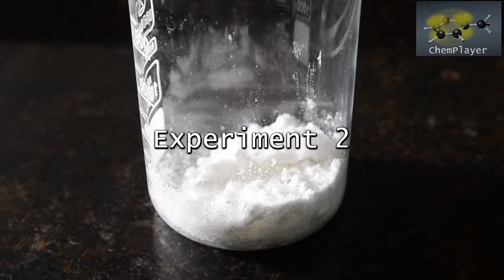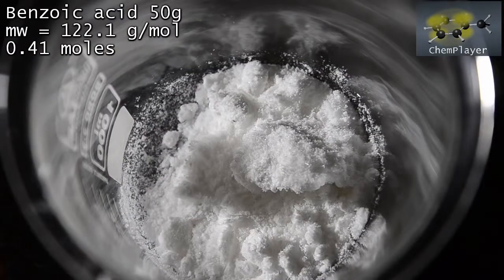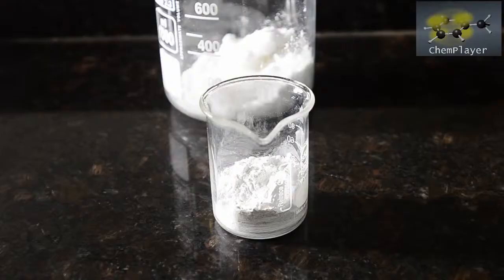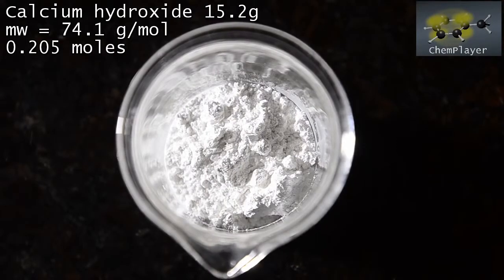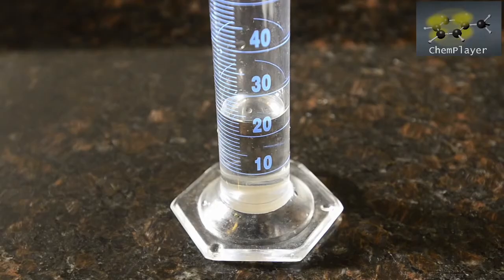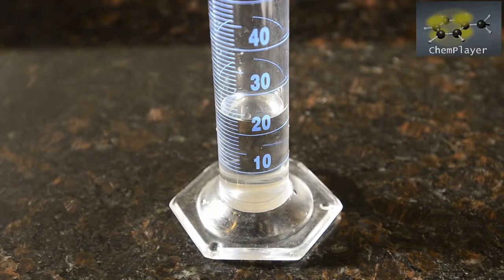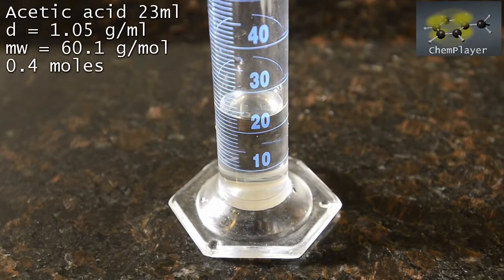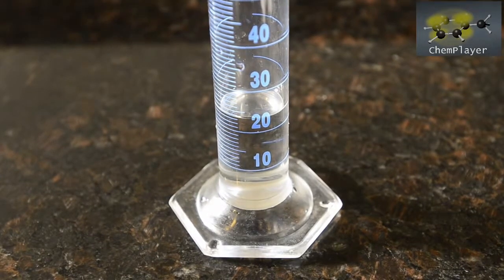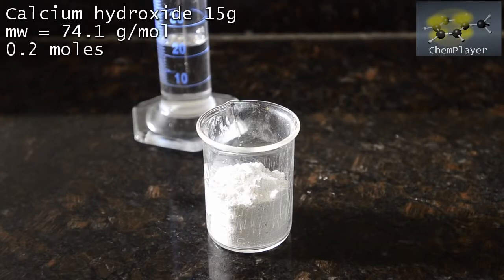Okay, take two. Here's another 50 grams of benzoic acid, prepared exactly as before. Here's 15.2 grams of calcium hydroxide to convert this to the calcium salt. And now for our other carboxylic acid. This time we're going to use acetic acid. So here's 23 ml, which is an equal molar amount to the benzoic acid. And here's 15 grams of calcium hydroxide again, which will neutralize this and create calcium acetate.